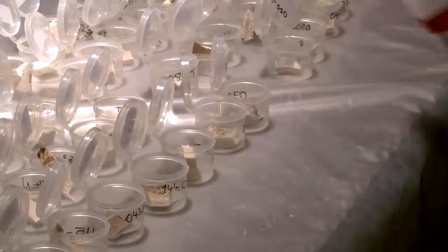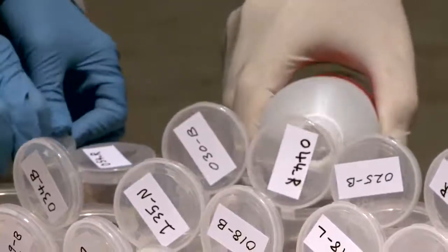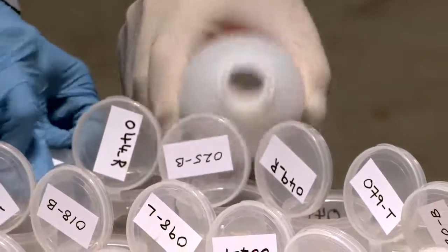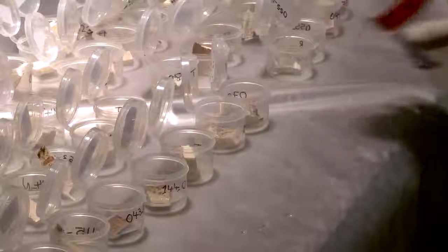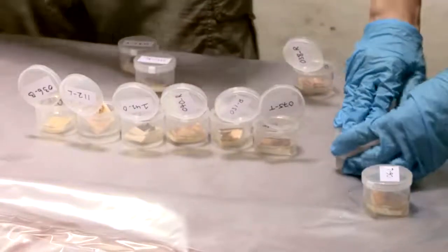Depending on the number of samples to wash and the facilities available when cutting the samples, it may be easier to perform this washing step the day after all samples have been taken. Pour the decontaminating solution over the sample until the level of liquid in the container reaches approximately 1 centimeter high. Close the container lid tightly.